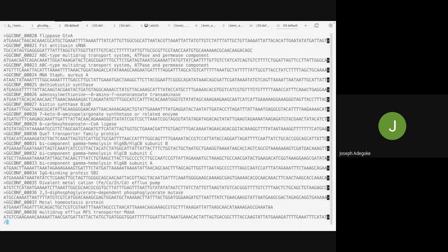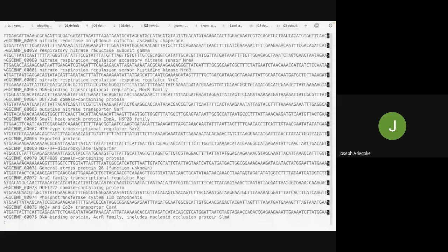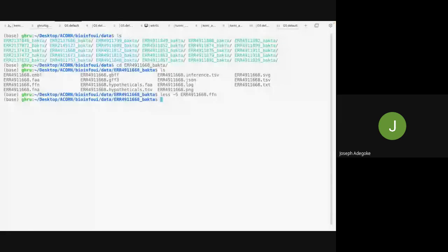Let me search for the beta lactamase. It's not the beta lactamase. I don't get the name now. Let me go to my TSV and properly get the name.